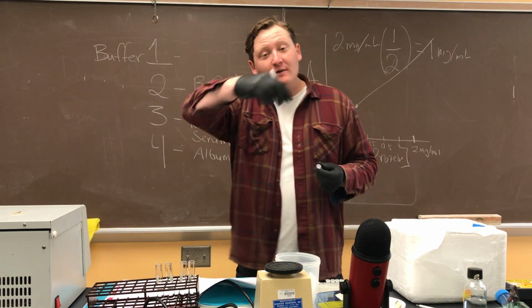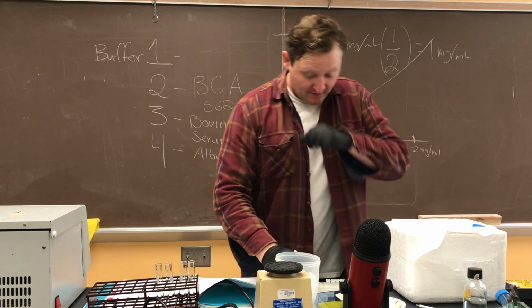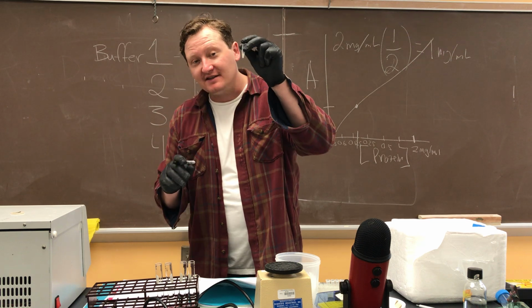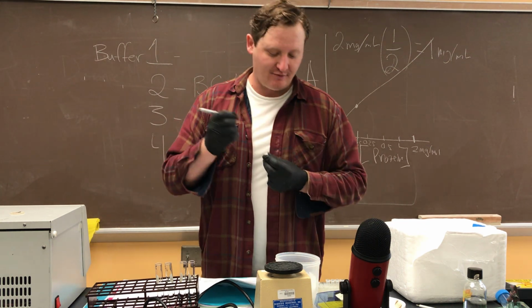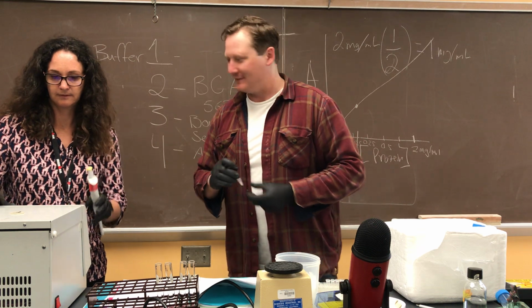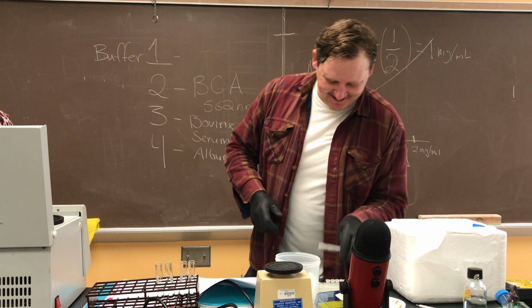So all of that work we did before, remember, that was all with bovine serum albumin. So this step here is where we're actually taking E. coli cells and we're going to split them open using different buffers and see how efficient we are at retrieving proteins. It's always good to double check why we're doing what we're doing as you run through a protocol like this. It's easy enough to get blinders on and just start going.